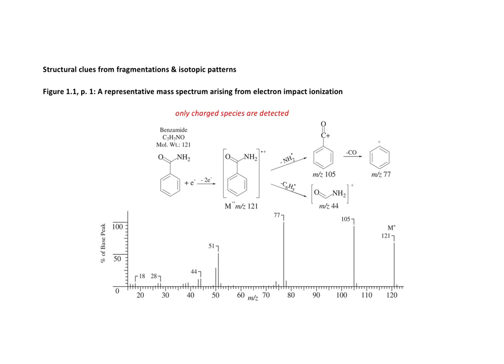Mass spectra can provide structural clues from the fragments observed and particularly from isotopic patterns. In the current era, where we rely on high-resolution mass spectrometry with soft ionization methods, you may never need to interpret an electron impact ionization mass spectrum. But you will see some fragments even in high-resolution mass spectra of structurally complex compounds. So it's worth briefly reviewing this.